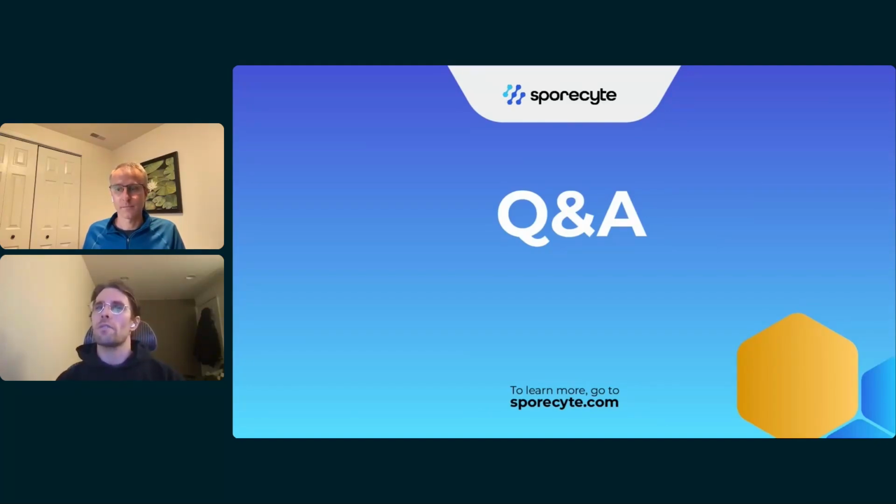So I've got another question from James. How accurate is our AI without human review, and how accurate is our AI with the human review? Since we designed the software to need a human review, I don't have good numbers to say how accurate it is without the review. As I just said, we purposely show our analysts results of lower confidence than we expect, so we can filter out the bad objects. This gives us better recall, better sensitivity to finding more of these objects, and we do that because the human analyst is there.